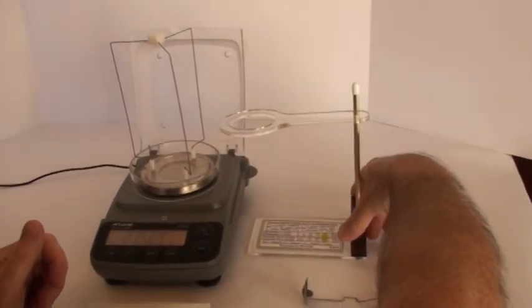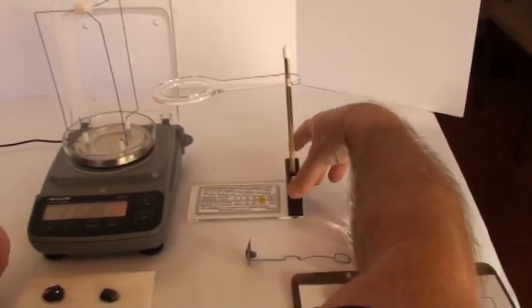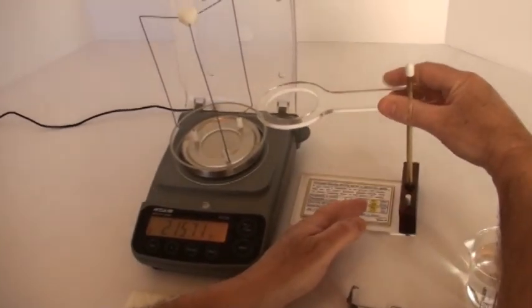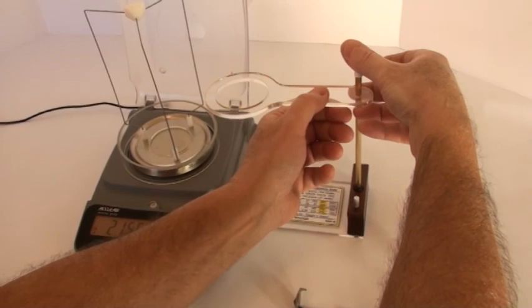Now the reason we call this a universal kit, among other things, is that the beaker holder itself is very adjustable: in or out, forward or back, even up and down for your beaker holder position.